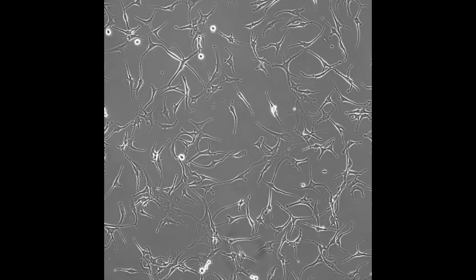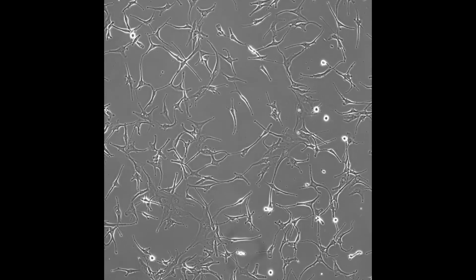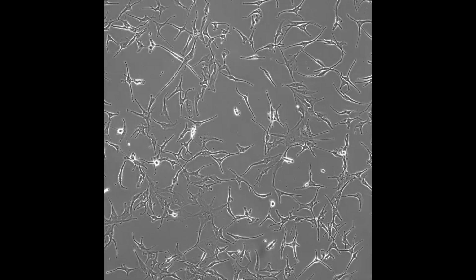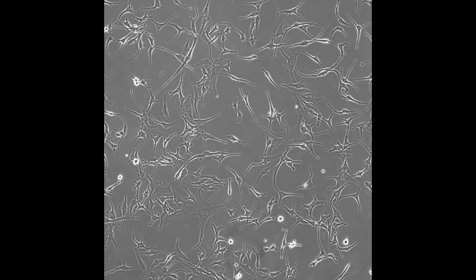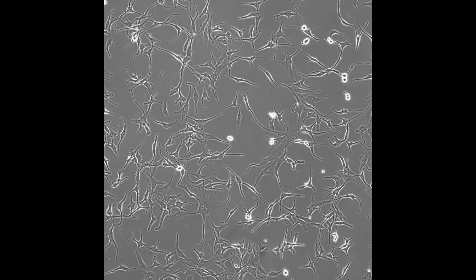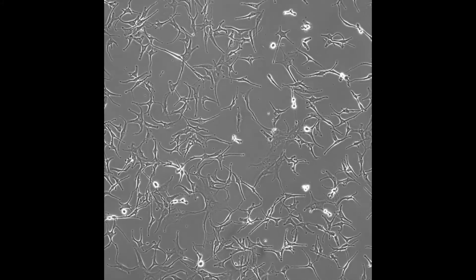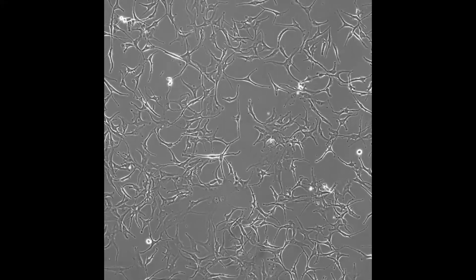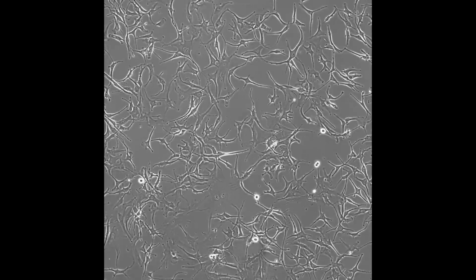Now, as the cells become more and more comfortable in their new environment, you should notice how they started dividing more rapidly, spreading and occupying new areas of the plate. I will increase the speed of the video so you can enjoy everything.